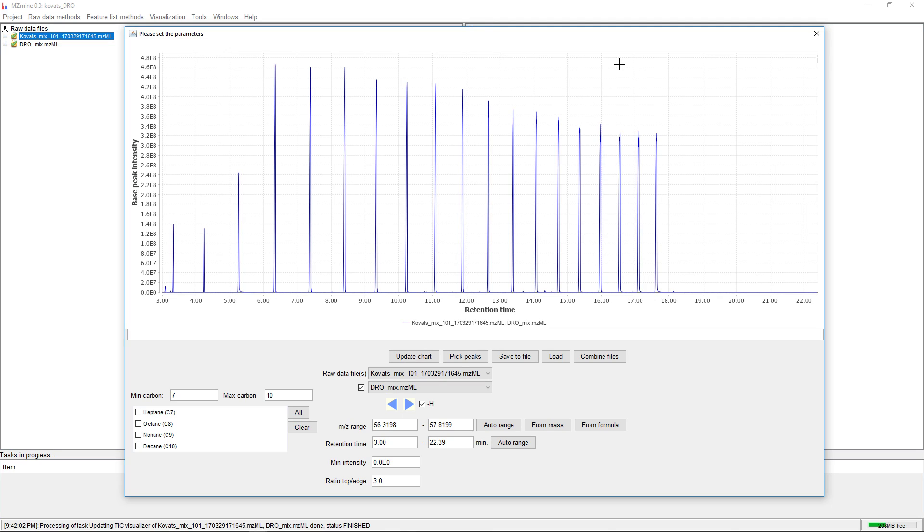In reproducible GC-MS, we often use the Kovacs index instead of the retention time if we want to match experimental spectra against the spectral library.